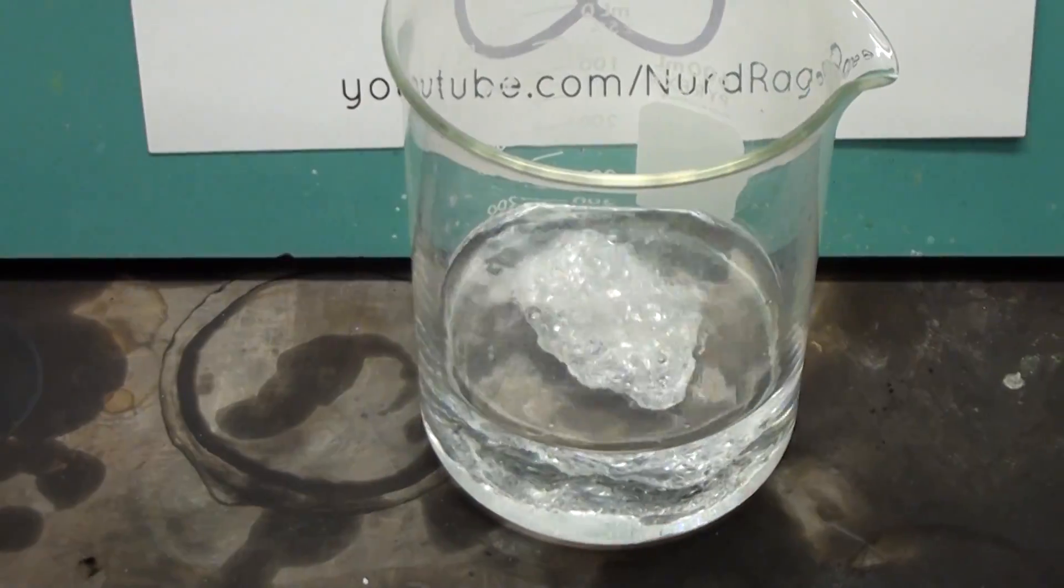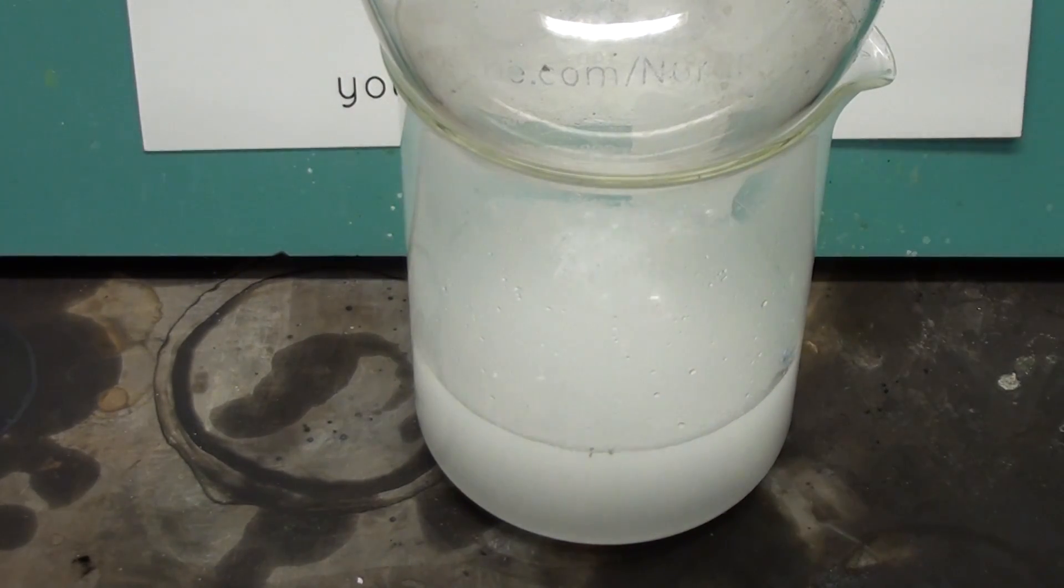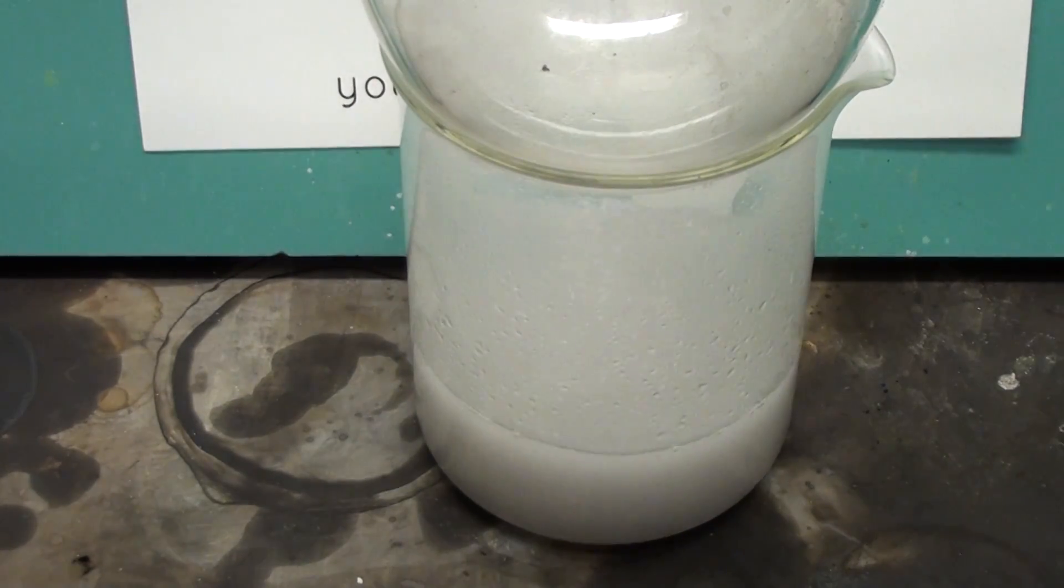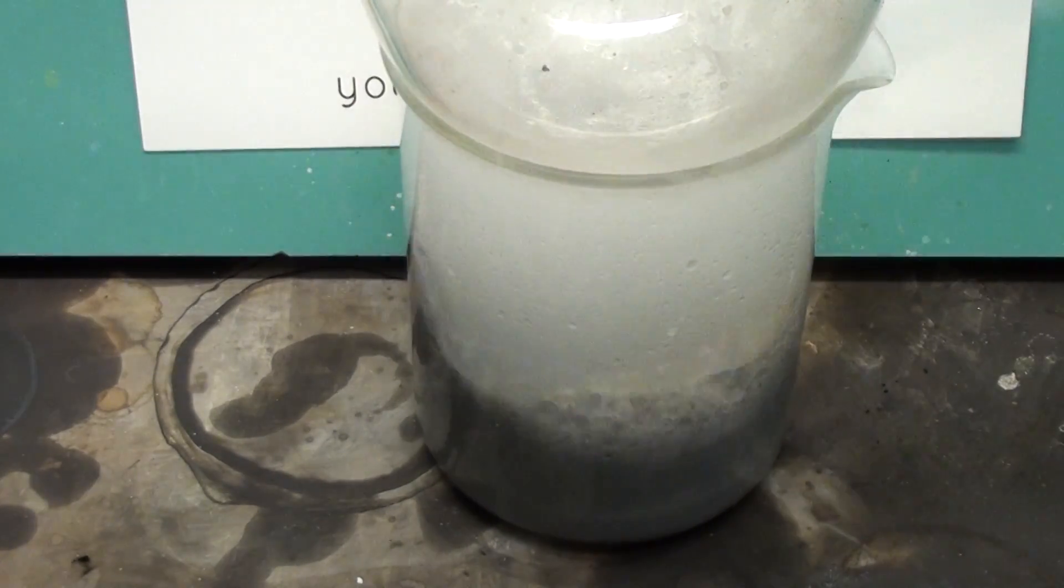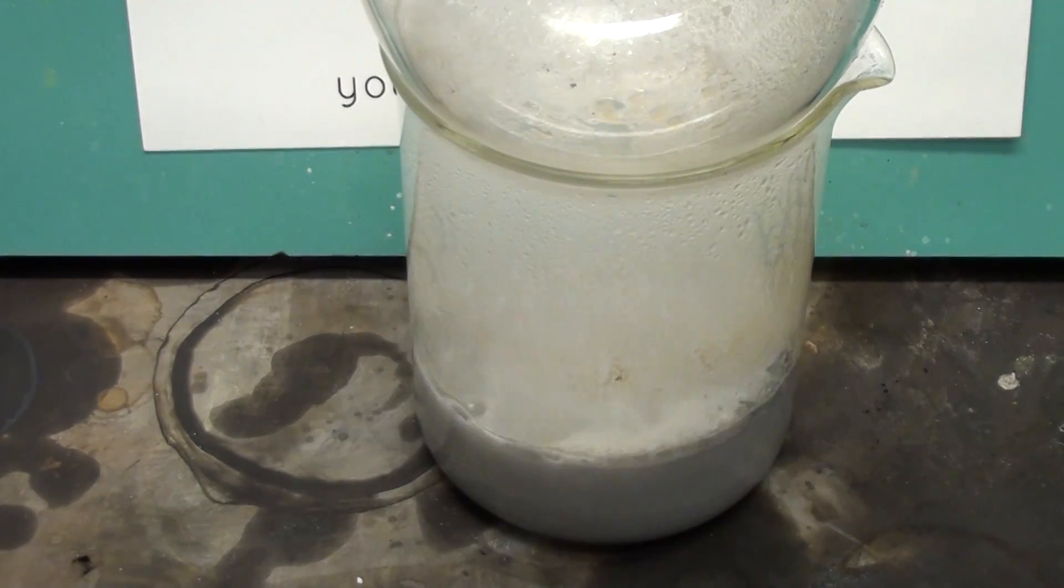Here is the concentrated hydrochloric acid. I'm putting this round bottom flask over it to keep it from splashing out. The acid is reacting with the aluminum foil to form hydrogen gas and aluminum trichloride. Since it's highly concentrated, the aluminum trichloride hydrate is precipitating out as a powder.